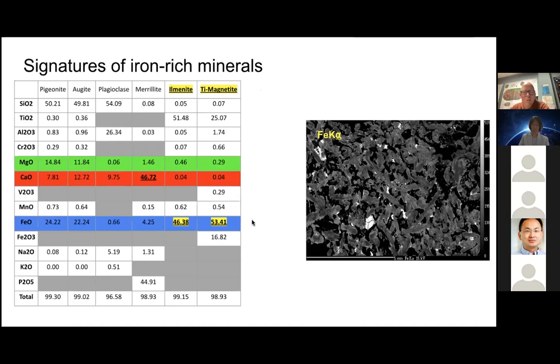But what I can tell you is the abundance of iron is relatively similar to the abundance of minerals like ilmenite and titanomagnetite. So the brightness is not going to be dramatically different between those three different mineral phases. We can assert that those mineral phases make up a lower concentration or abundance mineral within the rock, so it's not a major rock forming element.